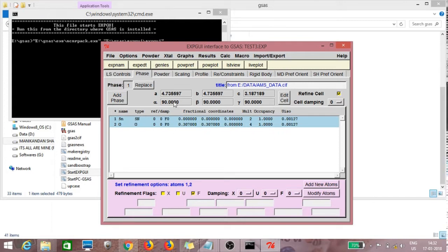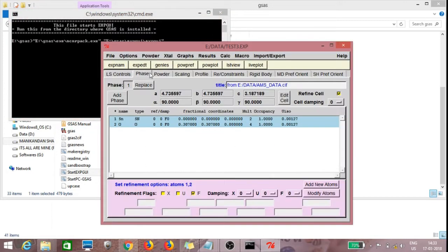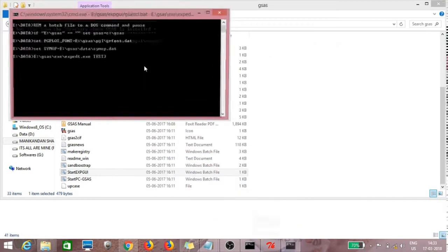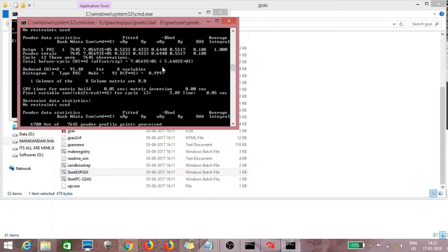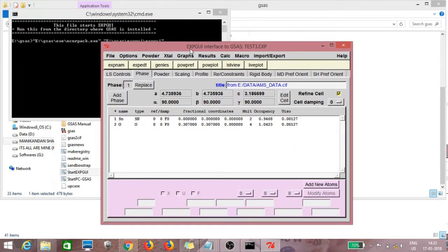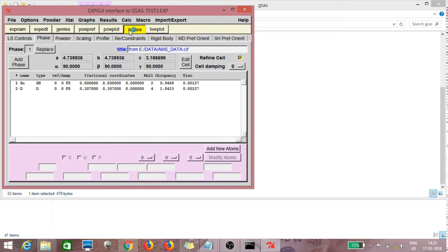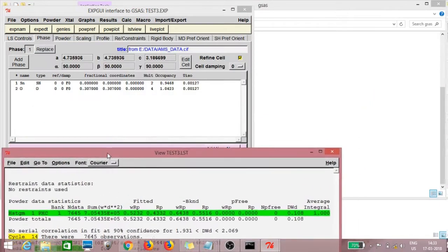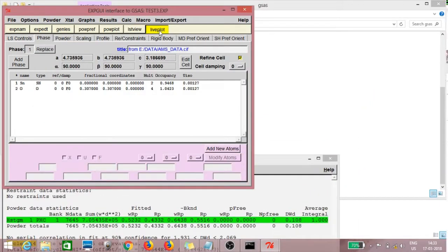Then F. Part 332. Let's see — Part 332. Now, list view. And live plot.